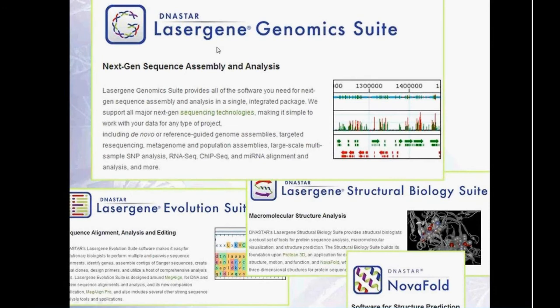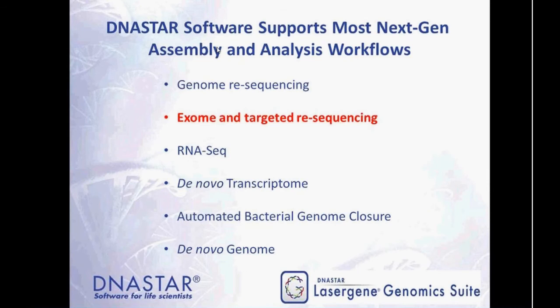But today we'll be focusing on the Lasergene Genomics Suite. So the Genomics Suite supports a wide variety of different assembly and analysis workflows. And we're going to be focusing today on exome and targeted resequencing, and we'll be looking specifically at some exome data sets.